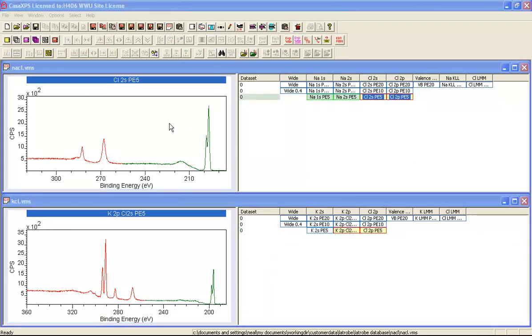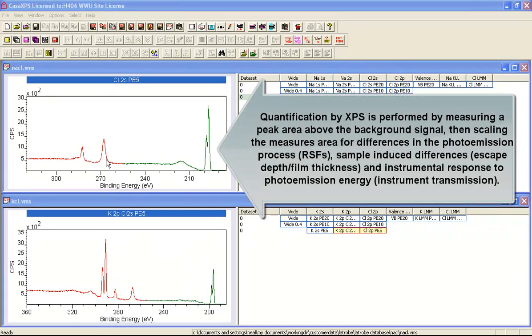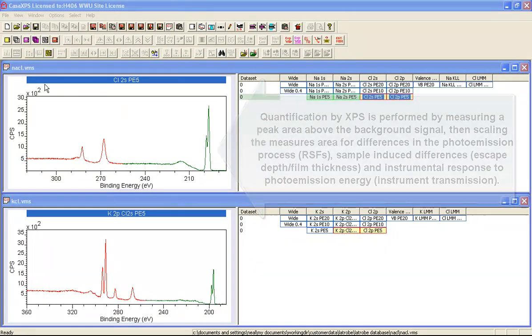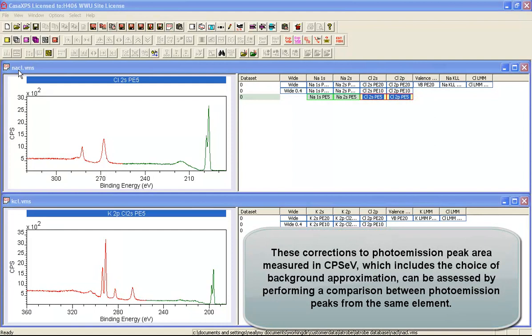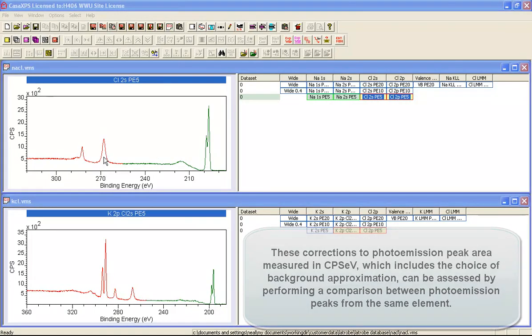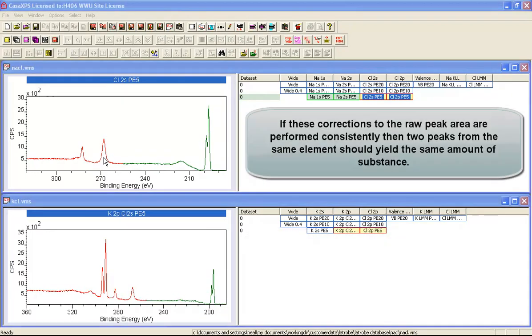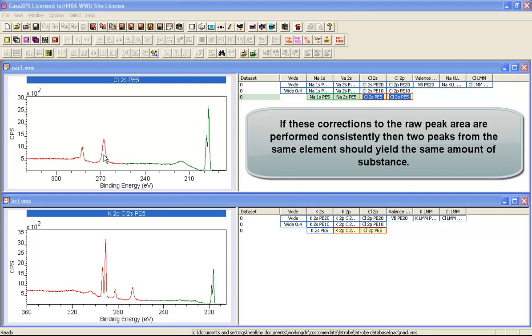Since we have two peaks from chlorine and both of them are well resolved, it shouldn't matter whether we choose the chlorine 2S or the chlorine 2P to perform the quantification. One of the tests that we can perform to see if we've chosen wisely the background and the sensitivity factors is to actually put a background on each of these chlorine peaks and measure the amount of chlorine. If we've chosen wisely the backgrounds and the RSFs then we should get a one to one relationship.